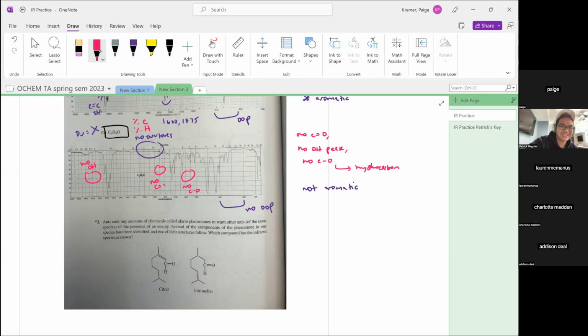That's why we prefaced in the beginning that you'll be given a way to find the molecular formula. So hopefully they don't confuse you too much. This was just an attempt to give you more practice. Again, we reemphasize they will give you more information, usually for combined spec. You'll also most likely have a proton and carbon NMR in one.